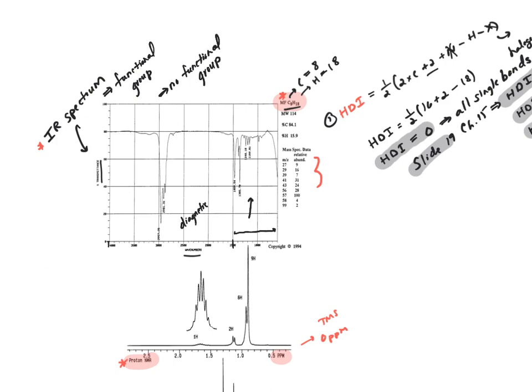Now, what if there is a functional group? I've talked about, especially in the lecture, really indicative functional groups in the IR spectrum. One of those that you should be aware of is the OH stretch for the alcohol group. Another one is the carboxylic acid. These give very broad signals due to hydrogen bonding, and again, it's going to be in a region where you would expect to find a hydrogen bound to something.